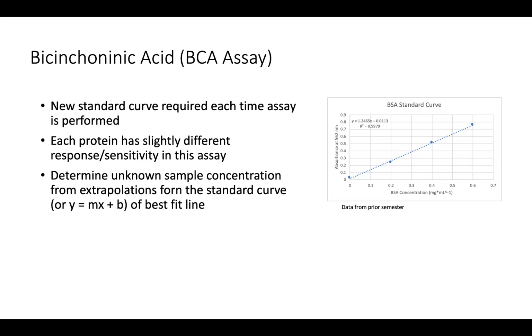I would start with the BCA assay to get your samples prepped and into the oven in order to be able to get ready to measure. The measurement is very time critical. I think I've said that about 4 times for your BCA. So after that wait period, make sure that you have your spectrometer set up so that you can immediately take those samples.